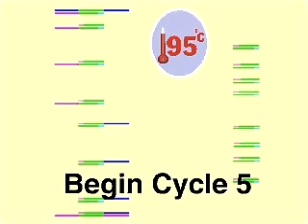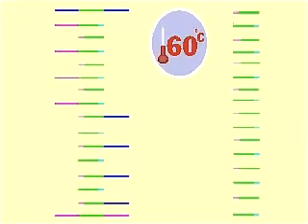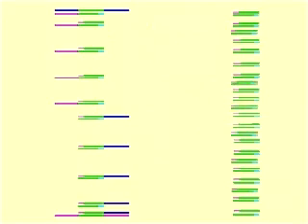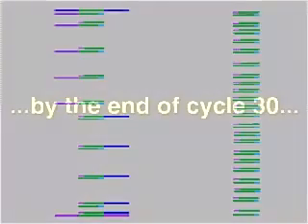In cycle 5, the heating, annealing, and synthesis steps are repeated. By the end of cycle 5, there are 22 target molecules and 10 longer ones. The number of target sequences continues to grow exponentially at each cycle.